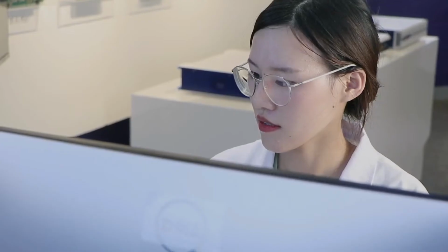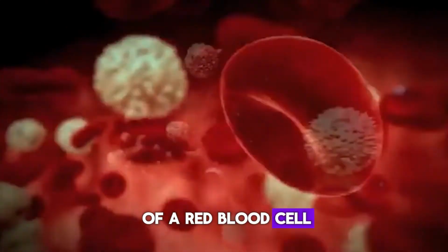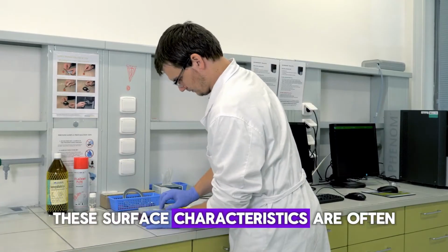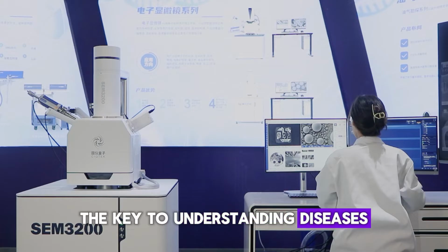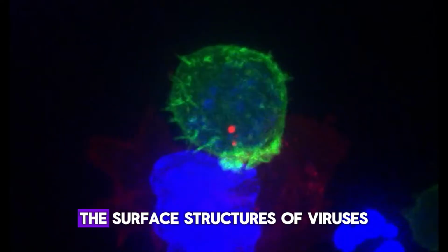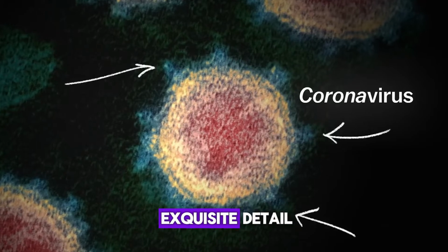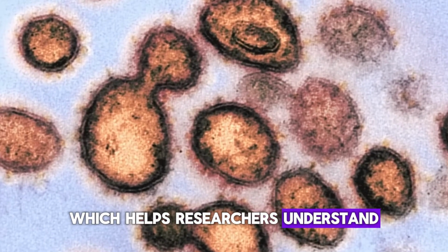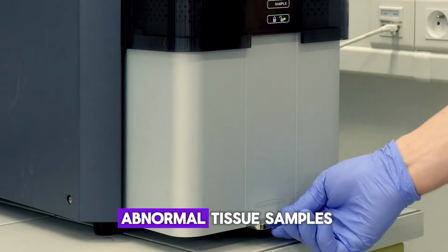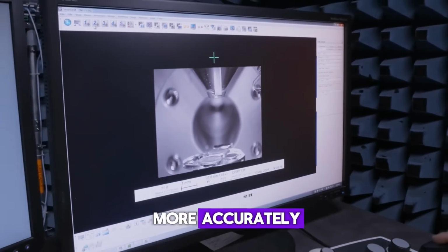Applications in medical laboratory science. In medical labs, SEM is a crucial tool. Imagine studying the intricate surface of a red blood cell or analyzing the minute details of a bacterial cell wall. These surface characteristics are often the key to understanding diseases and developing treatments. Take virology, for instance. The surface structures of viruses, like coronaviruses, can be visualized in exquisite detail, which helps researchers understand how they infect cells. In pathology, SEM is used to examine abnormal tissue samples at a cellular level, helping pathologists diagnose diseases more accurately.